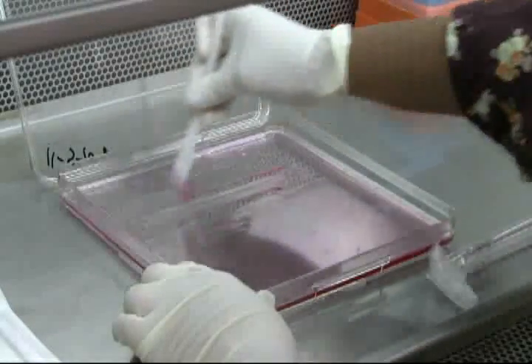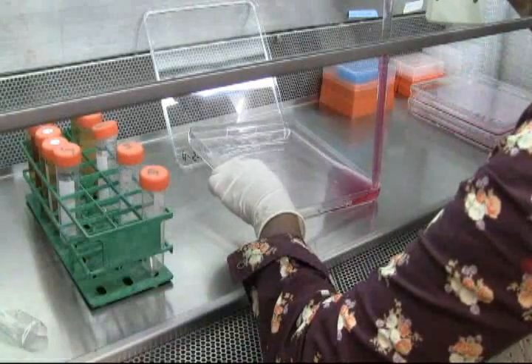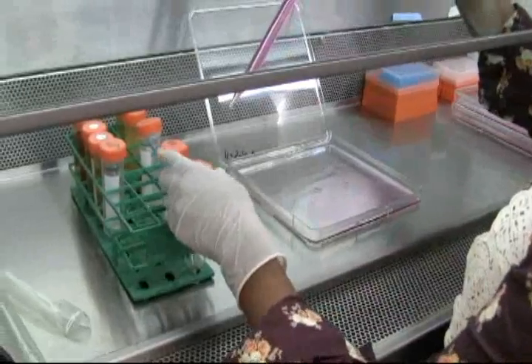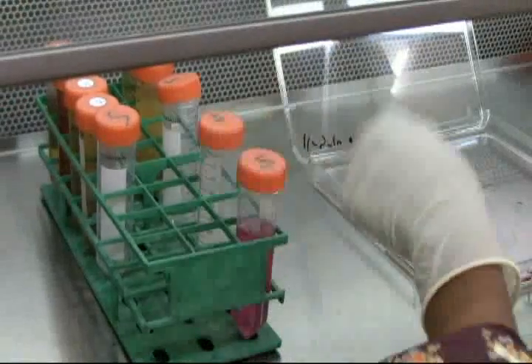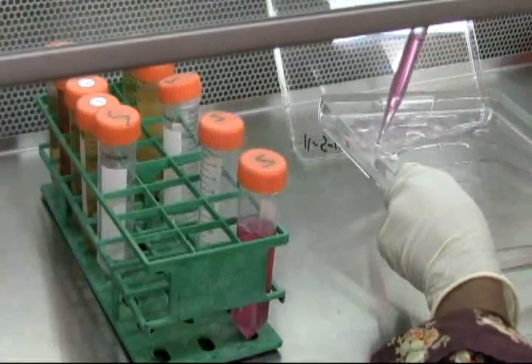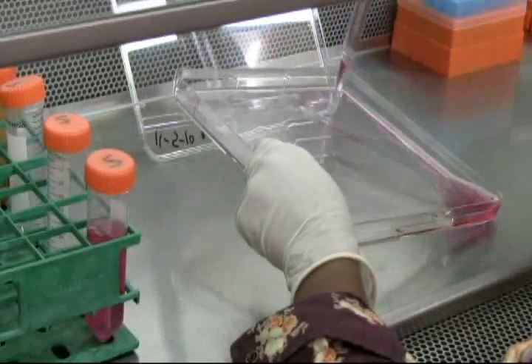Plating the HeLa cells within a 500 cm culture plate provides a high yield density. After 1.5 to 2 hours of incubation with the colcemid, scrape your cells from the culture plate and transfer the cell suspension to a 50 mL centrifuge tube. It is very important to retrieve as much of the cells as possible from your culture plate to result in a nice size pellet during centrifugation.